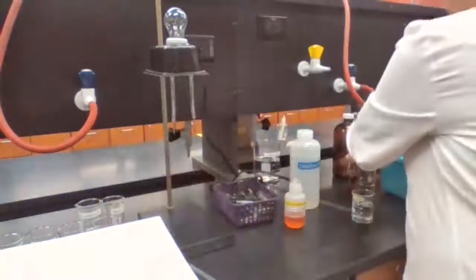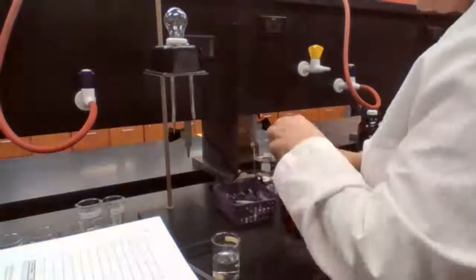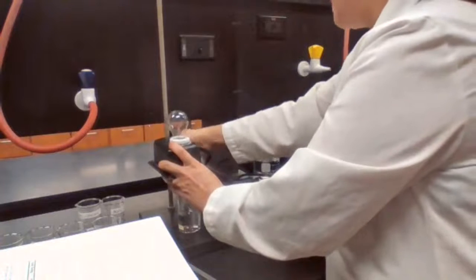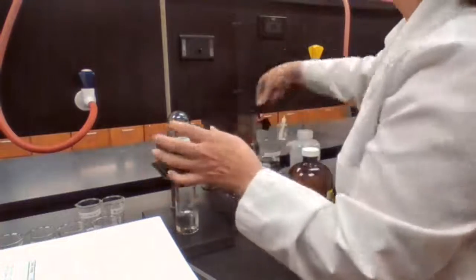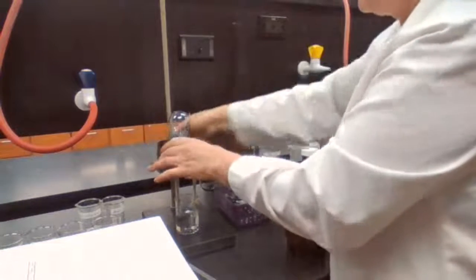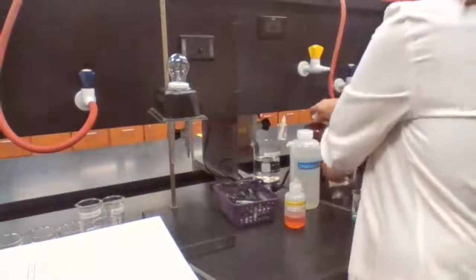Methanol is the next one. Methanol is an organic, molecular compound, so it's not expected to conduct, but that's not what we are here for. We are here to experiment, to find out by experiment if it's going to be a conductor or not. So the next item is methanol. The light bulb did not turn on, not even a dim light. We call that a non-electrolyte. So methanol is a non-electrolyte.